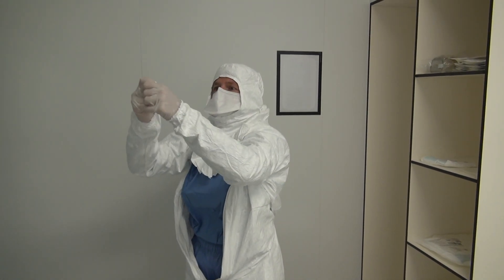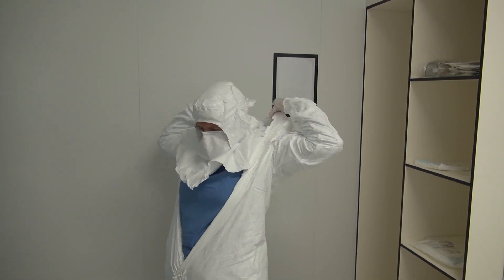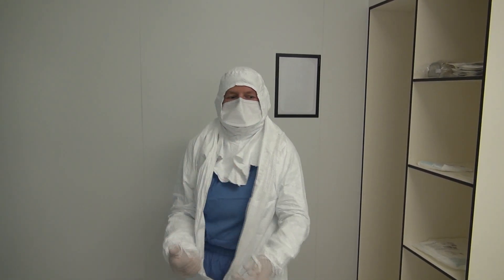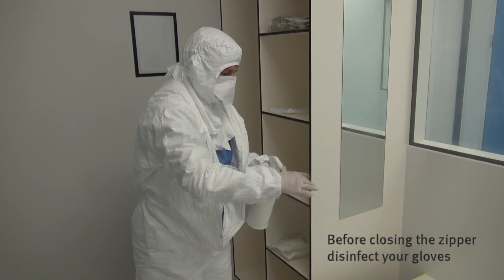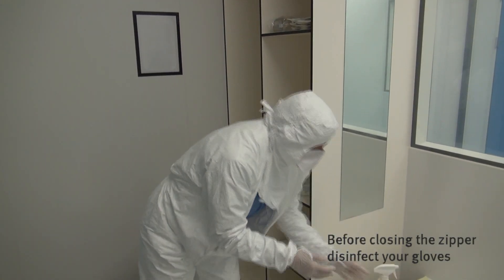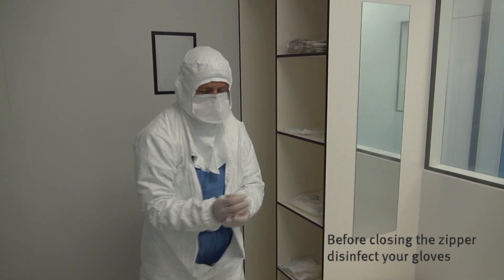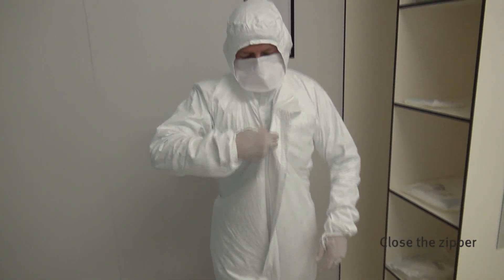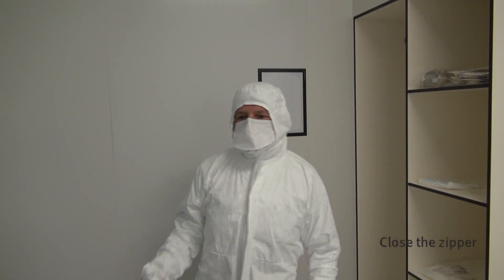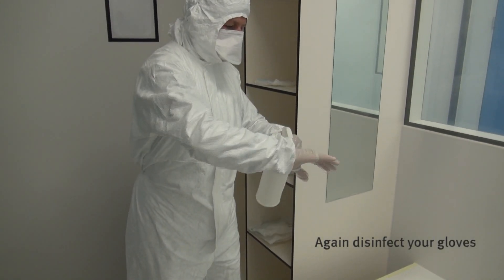Stick your thumbs into the thumb loops. The shoulder cover of the hood should be tucked completely into the coverall. Before closing the zipper, disinfect your gloves. The zipper closes easily when you cross your legs and gently stretch your trunk. Again, disinfect your gloves.